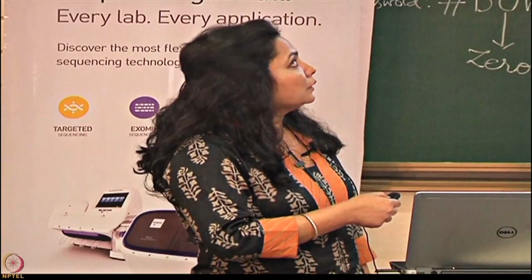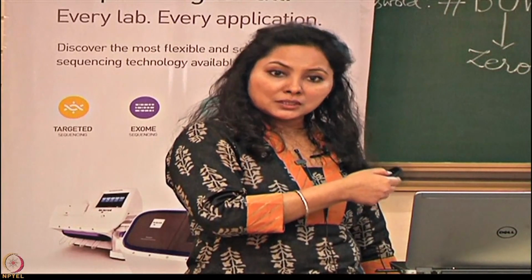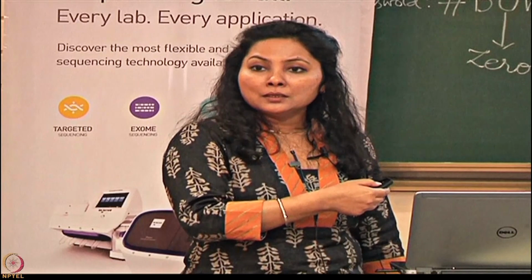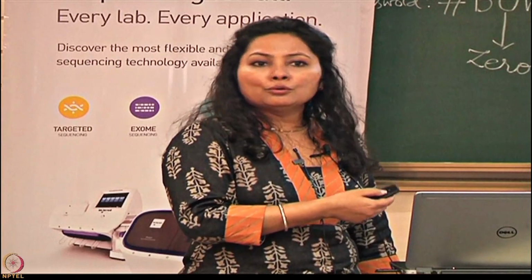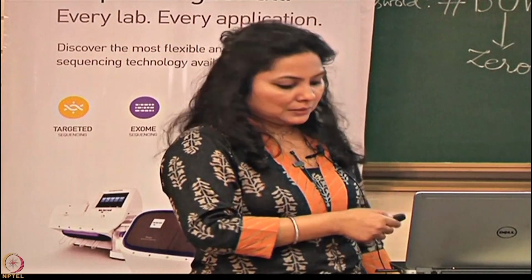Now supposing A is your first base, and the system had flown dGTP. G is not going to bind to A, so there will be no binding, no hydrogen ion release, no change in pH, and no signal detected by the system.